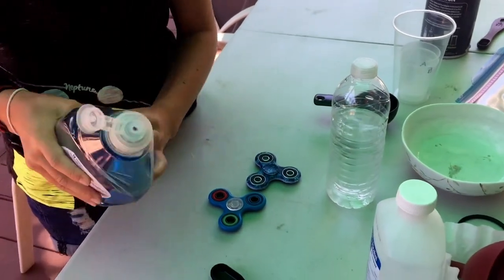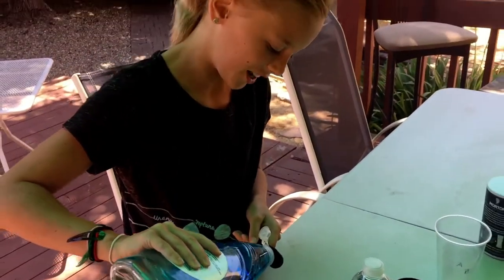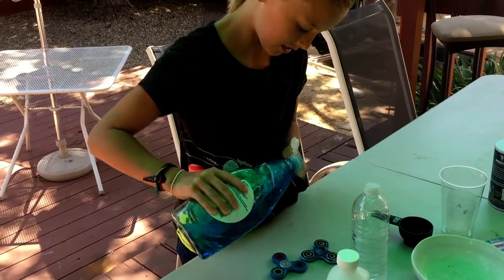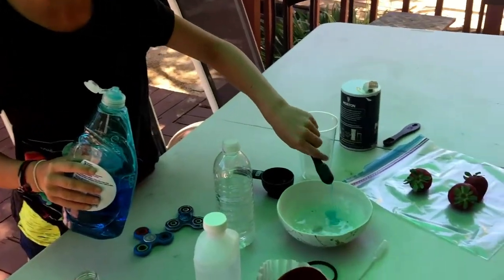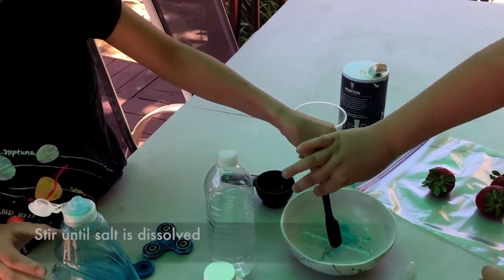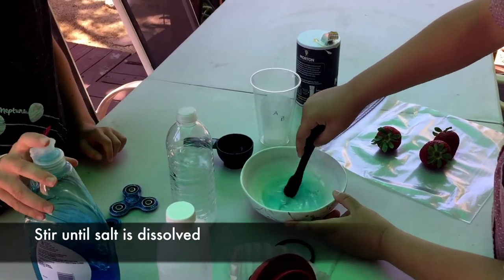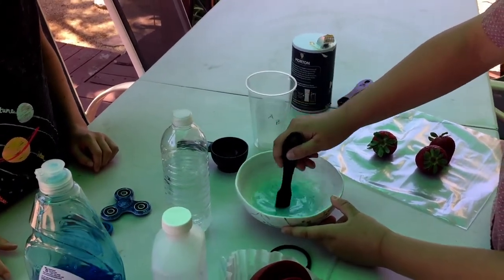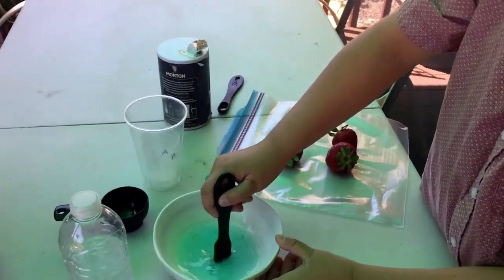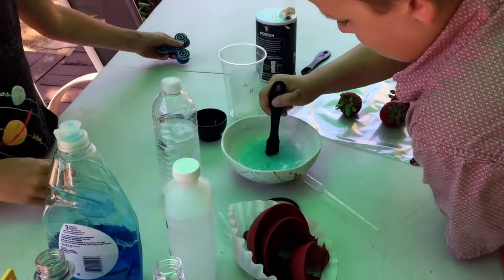So extracting DNA from a strawberry — as with all experiments, this might take a few tries. We can stir that around a little bit. It bubbles. Nice and gentle — we don't want too many bubbles. We want to make sure the salt crystals are all dissolved. Keep stirring until they're all gone.